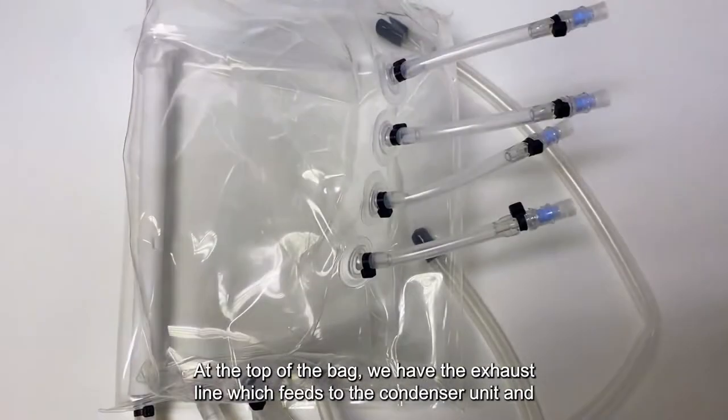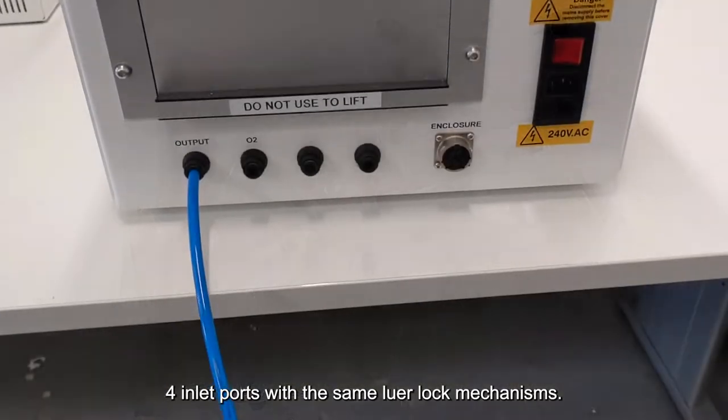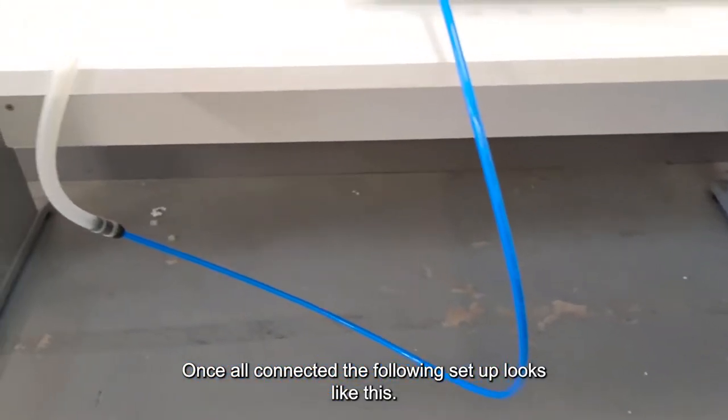At the top of the bag, we have an exhaust line, which feeds to the condenser unit, and four inlet ports with the same luer lock mechanisms. Once all connected, the following setup looks like this.